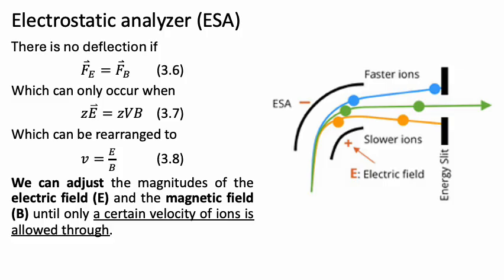Again, ions that are too fast and ions that are too slow are not let through the slit at the end. What this means is that now we have a second stage at which we've focused, and we've let through things of only a certain velocity, but we're also losing things. So each step is decreasing our sensitivity in the end because we're losing a certain amount of ions.